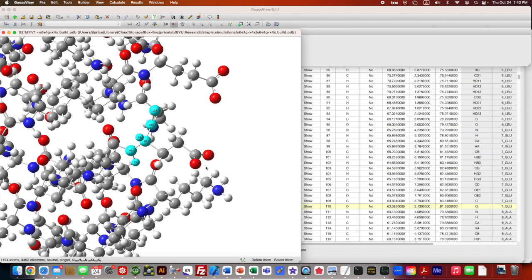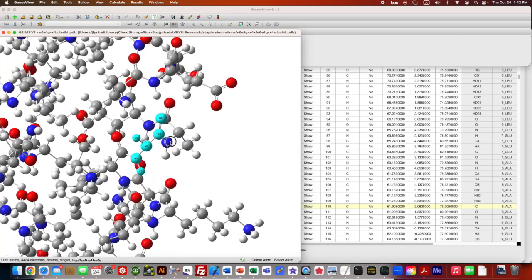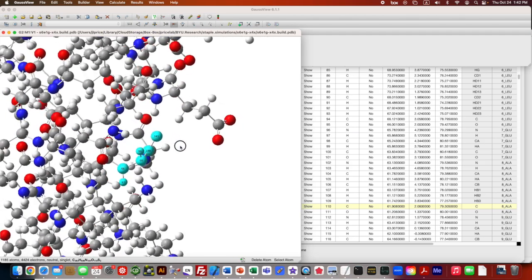Yeah, that is really annoying about PyMol. So I'm just going to click the atoms in the side chain one by one. We could also, in principle, go manually through and just delete those lines from the PDB. All right, so what we've got there is what's left.